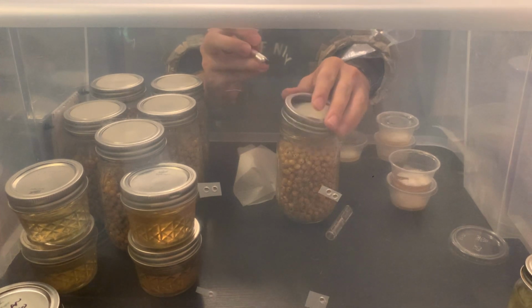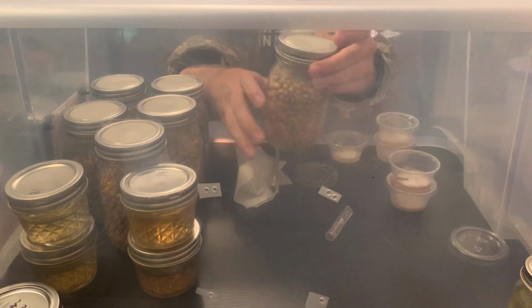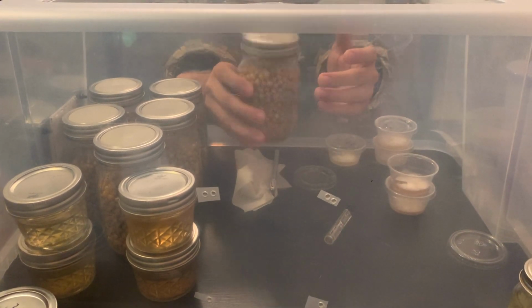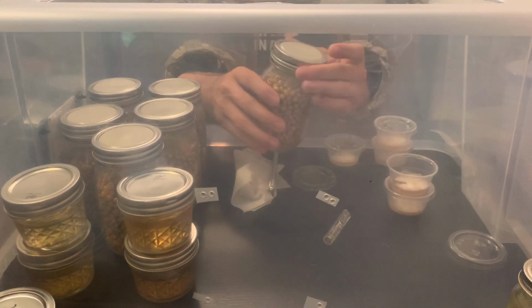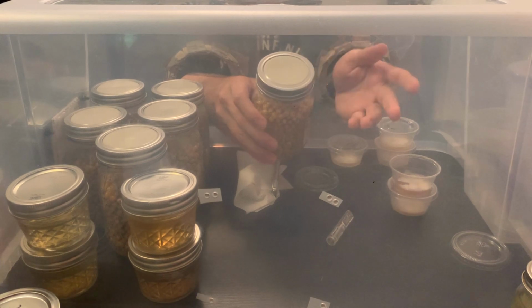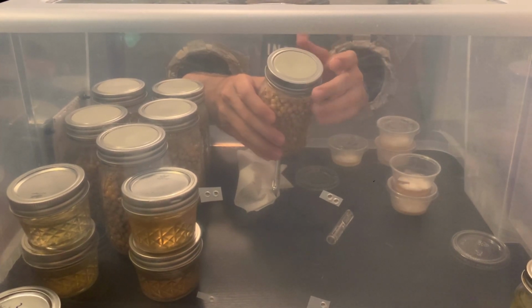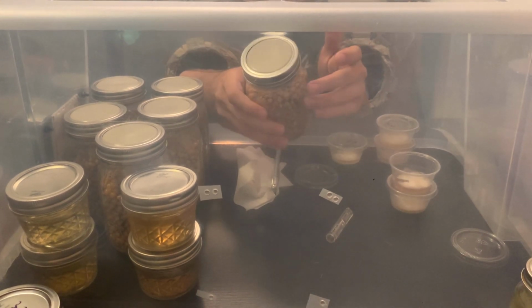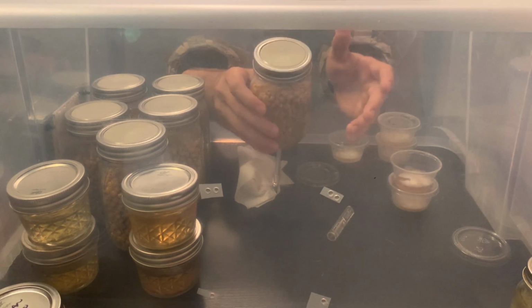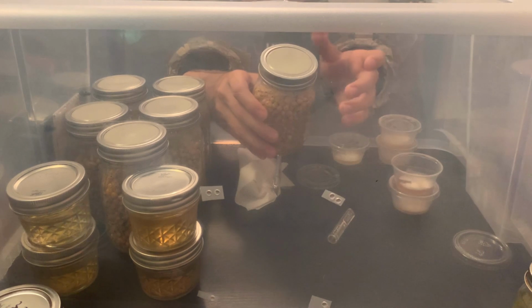This one doesn't. Okay, there we go. So after you throw a couple pieces in there like that, you just want to give it a little, not a huge shake, but just get it a little bit buried in there. And then once again, close it up, give it that half turn, and then set it aside for a few weeks. Once it's about 30% colonized, shake it up, break it. That's going to distribute the growth points of the mycelium so that it's going to colonize the entire jar faster.